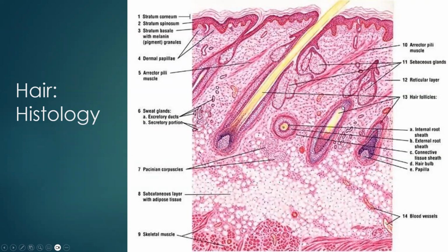This is another example of hair that is not sticking out. So I'm more likely to ask you from this typical shape we're expecting. Make sure you know the difference between the follicle and the hair itself. And then we can also talk about glands. If you're looking under a microscope, usually we'll have some nice examples of sebaceous glands wrapping around the hair, in this case, the hair shaft or hair root.